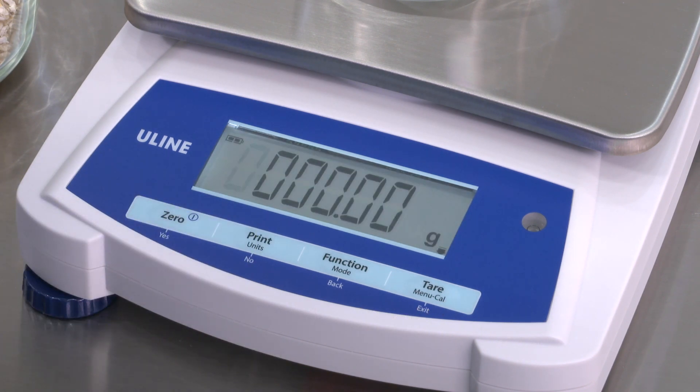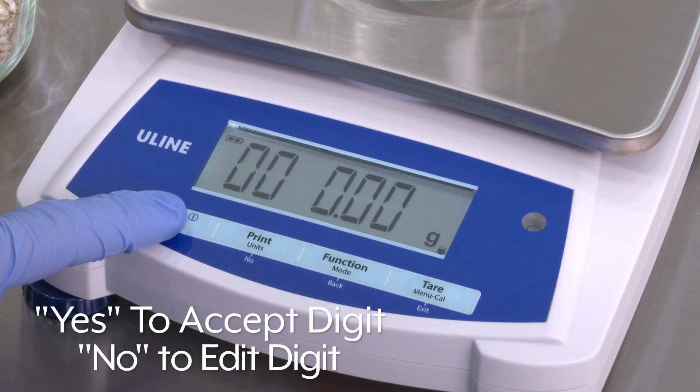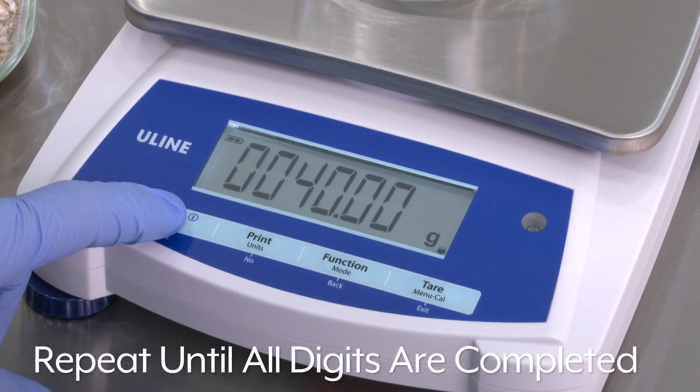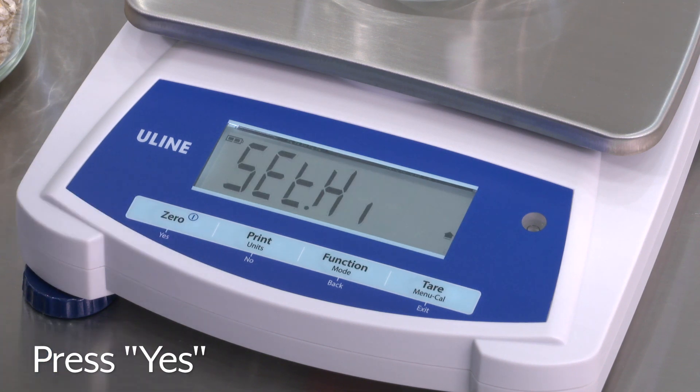Repeatedly press No until the desired number appears. Press Yes to accept and move to the next digit. Repeat until all digits are completed. Press Yes to accept the low limit value.